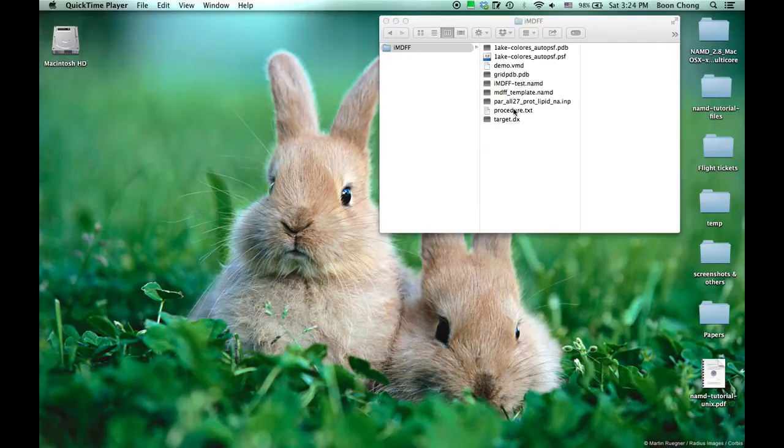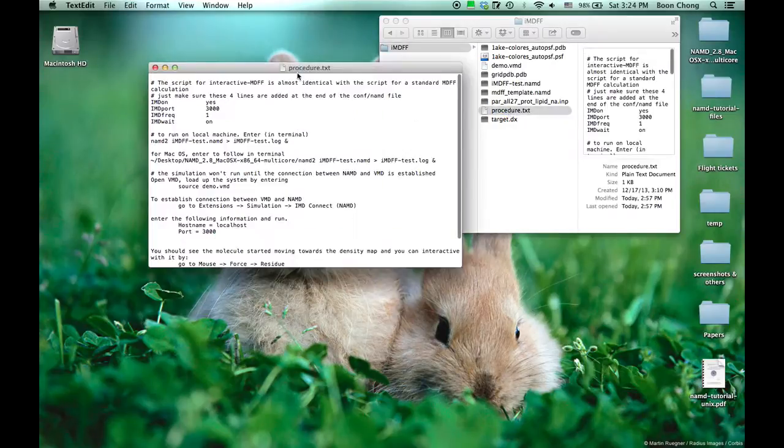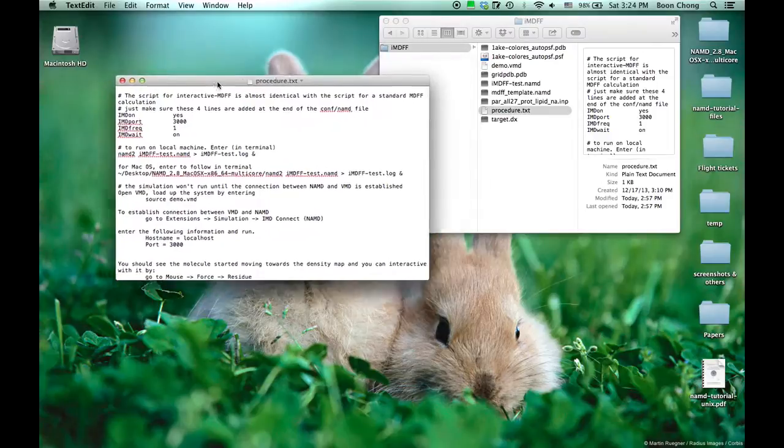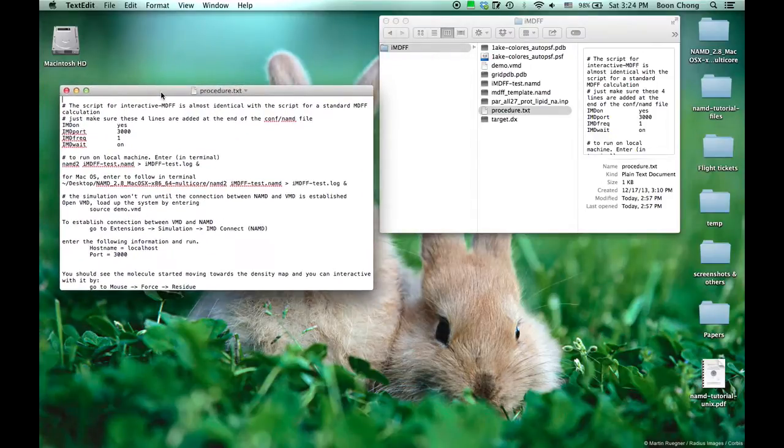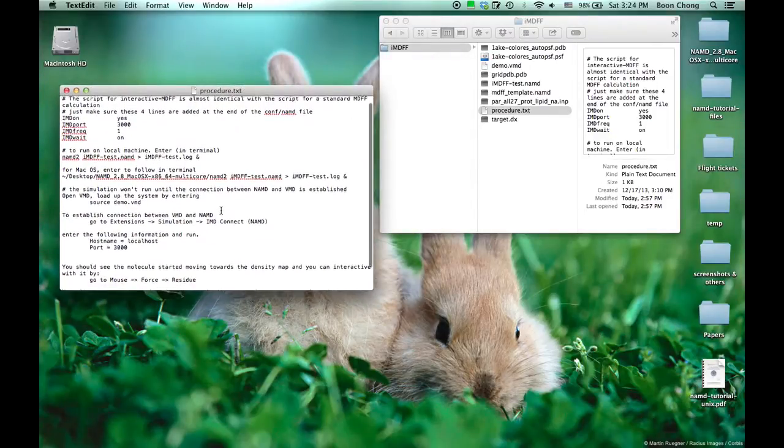First you want to look at the procedure. This tells you the general thing to do.